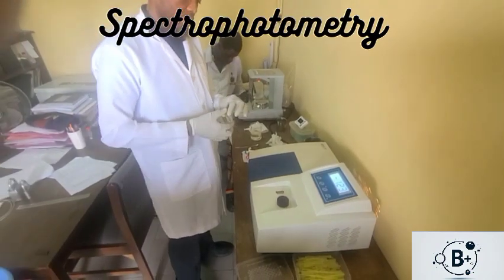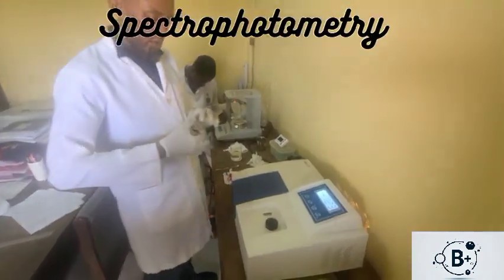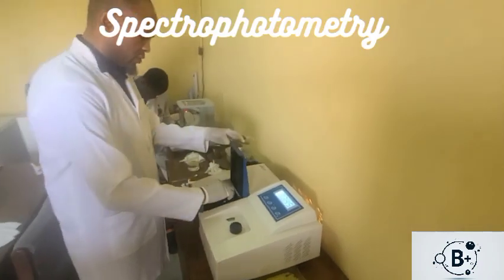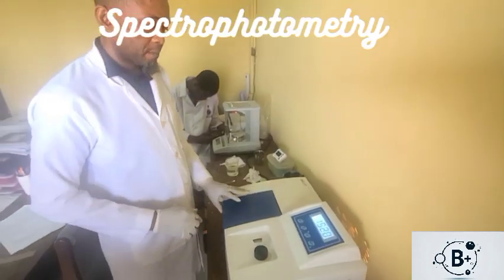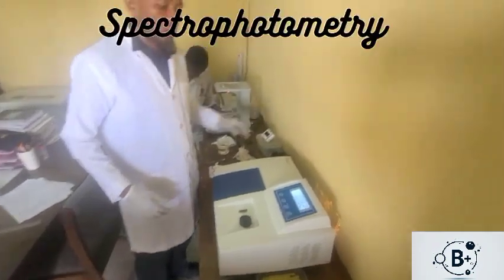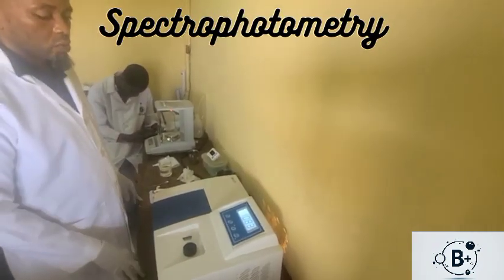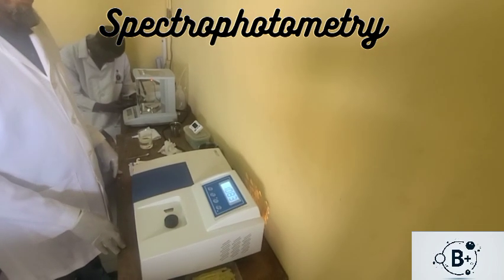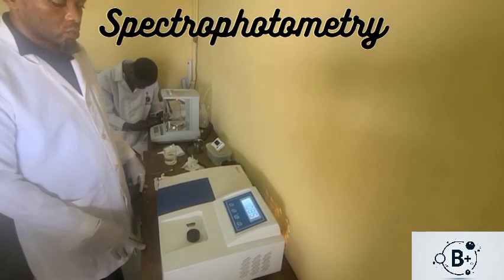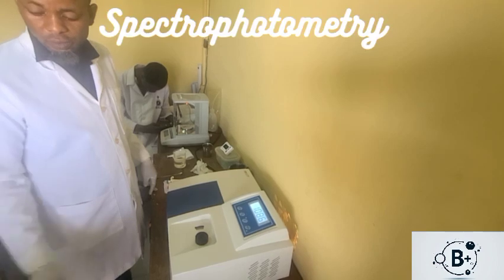So this one, I'll face it into the carton. I'll take the initial reading at 0. 1.83. 1.03.